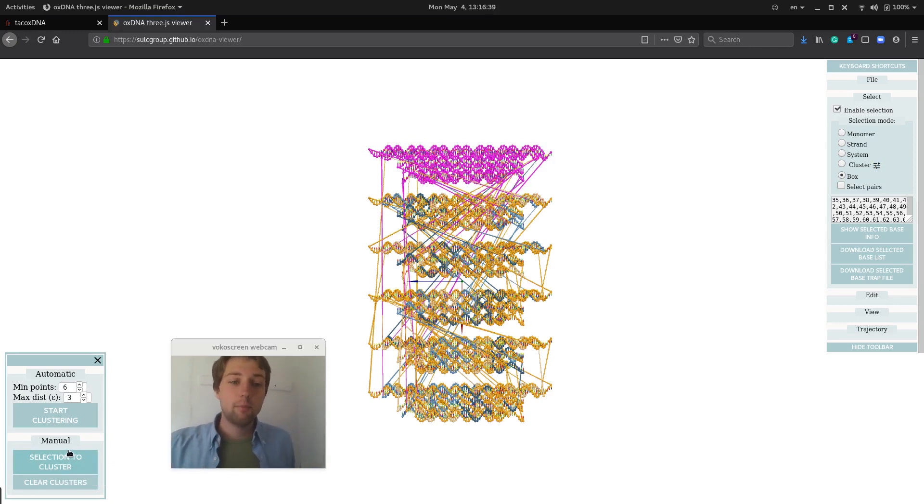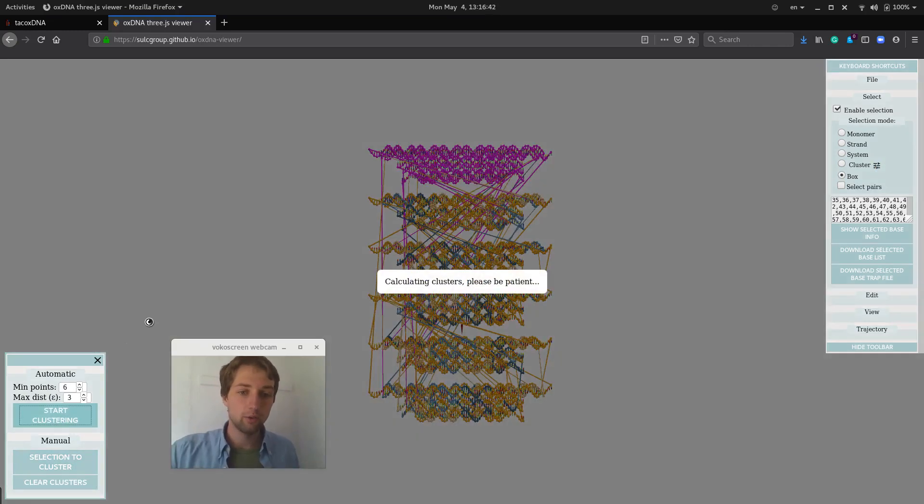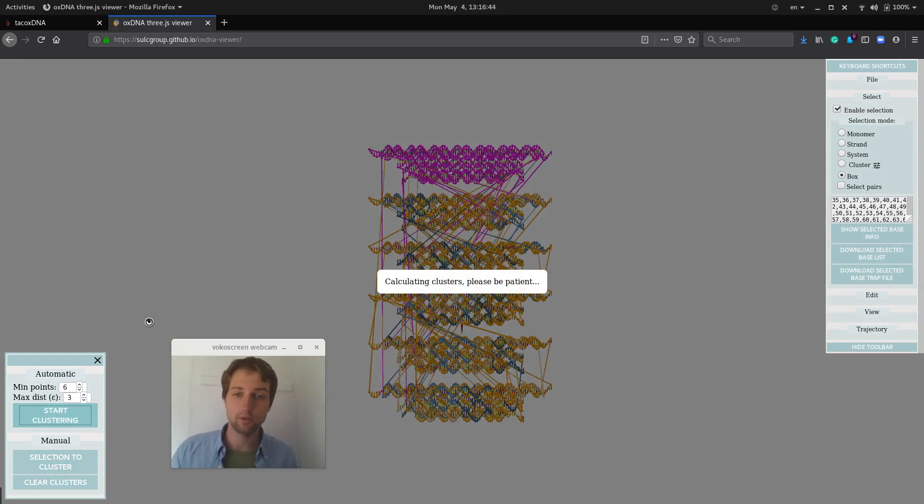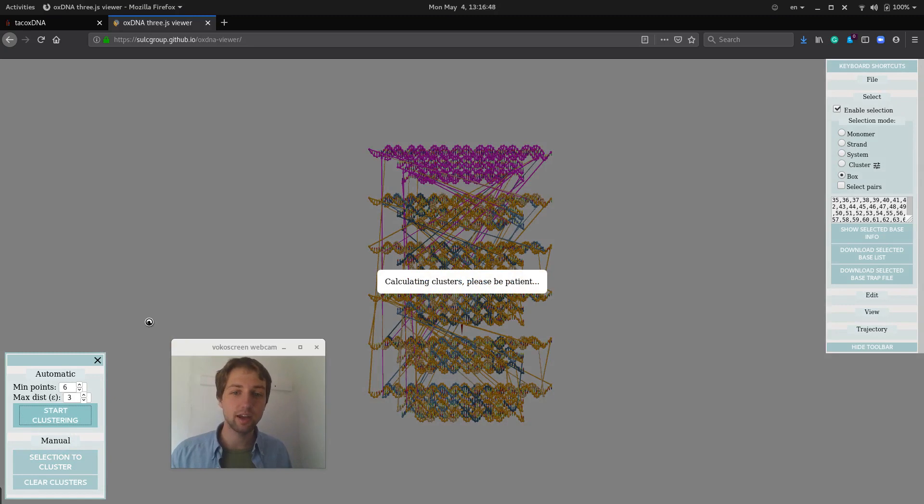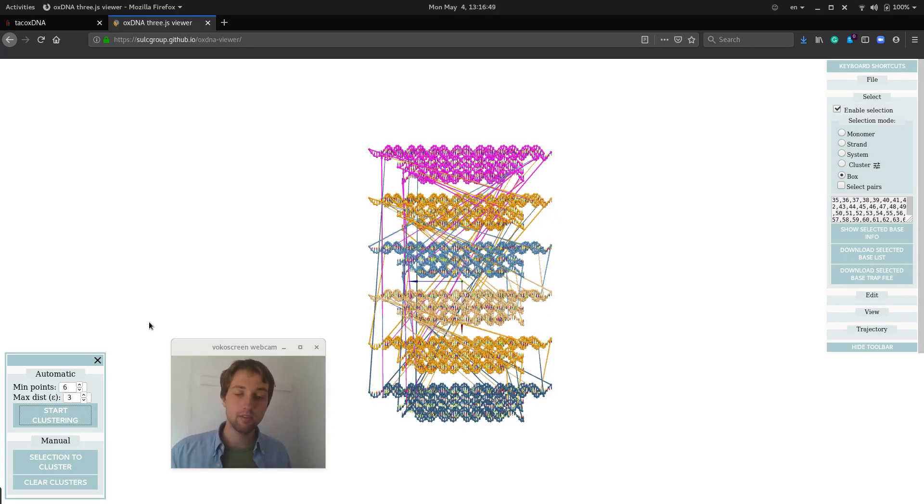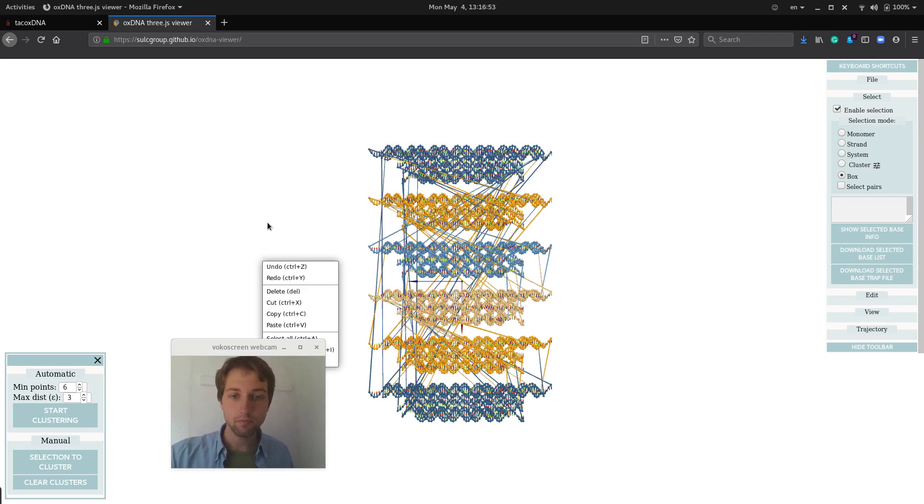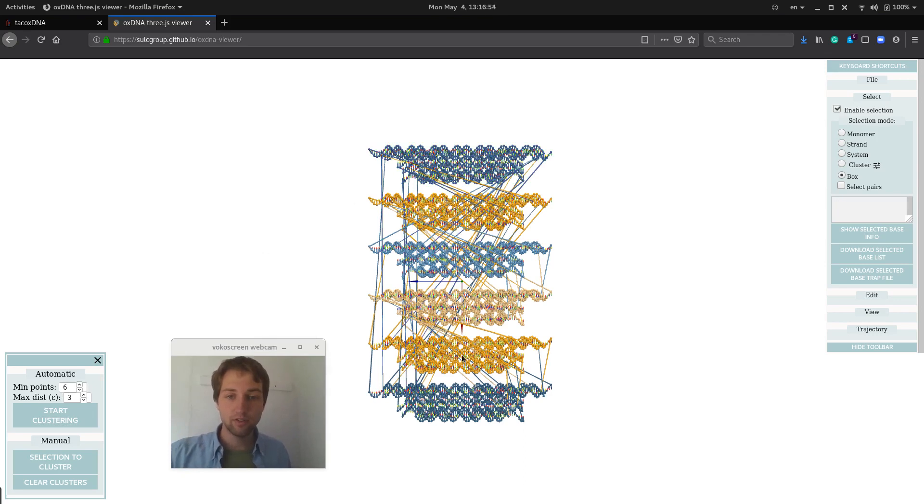But the lazier way is just to do automatic clustering, which for a small structure at least, runs pretty quick using this DBSCAN algorithm that looks for spatial separation between the nucleotides.